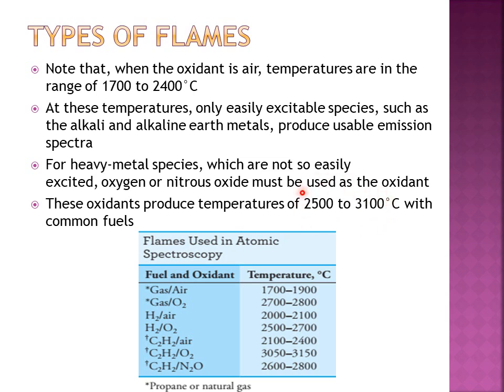So the temperature is high. By using these flames in which the oxidant is oxygen, we can study even those species which are not easily excitable.